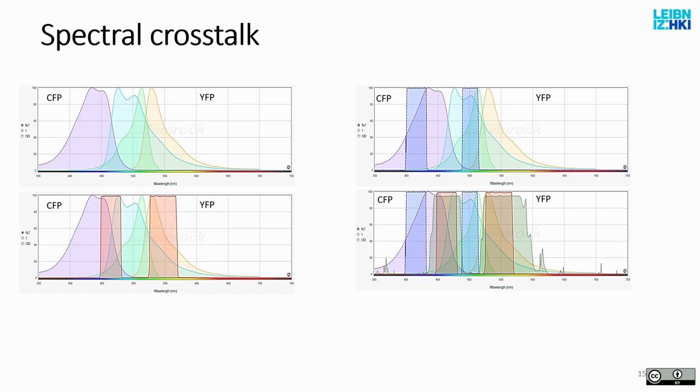If you have certain secondary antibodies, for example, of which you know the spectra very well, you will make samples which are not labeled at all, labeled with one fluorescence label, or with two, but you measure the signal from every channel that you are going to detect, and this way you know how much, for example, of the blue goes into the green and red, or how much of the green goes into the red, and so on and so forth.